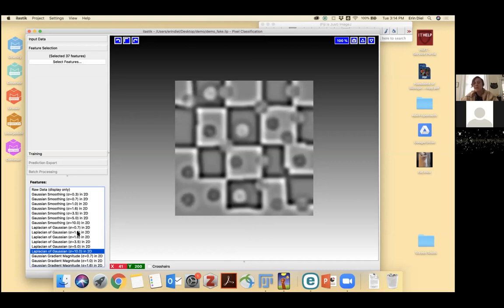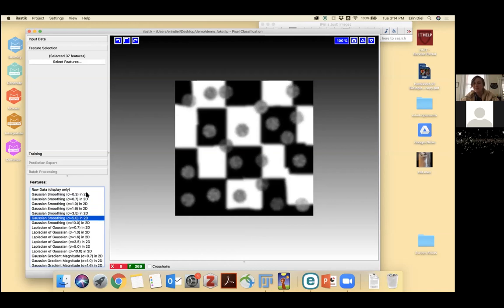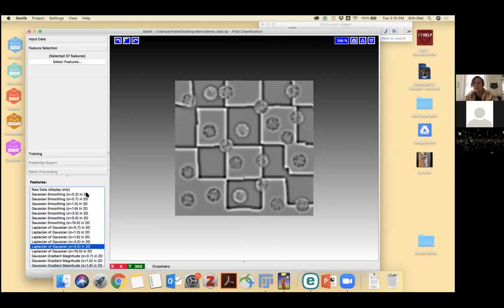And so imagine previously you just had a single pixel that you were considering here, and the only information you had about it was maybe its location, but just the value that it was 255. And that 255 was all you were going to use to separate foreground and background. But now you have the gray values from all these different images, which represent not only that pixel, but also something about the neighboring pixels. And similarly, all these edge filters. And so you can imagine combining all this information to tell you a little bit more about that individual pixel.